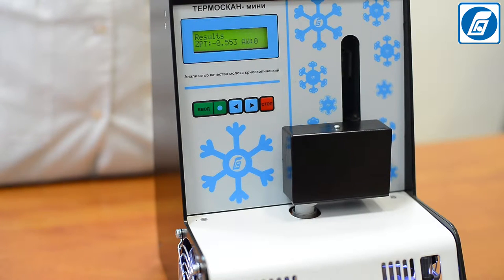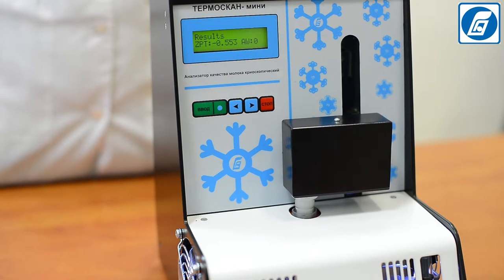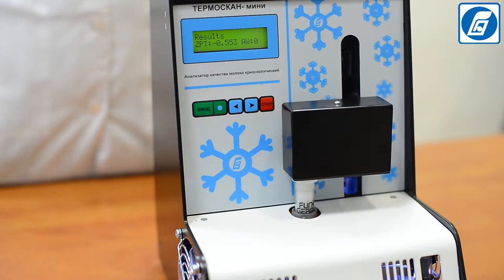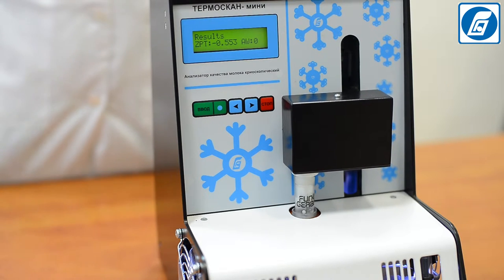After completing the measurement, the percentage of added water and the freezing point are shown on the display. For the analysis, samples of the following types of milk can be used.